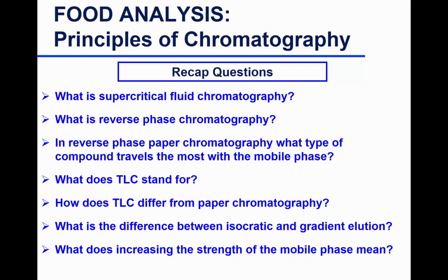It's not always increasing the water or increasing the organic solvent concentration, or you'll see later we change the pH when it's ion exchange chromatography. We change the pH, we change salt concentration. So changing the strength can be done in so many different ways. As long as you understand the concept of increasing the strength, then you will know how to change the mobile phase.